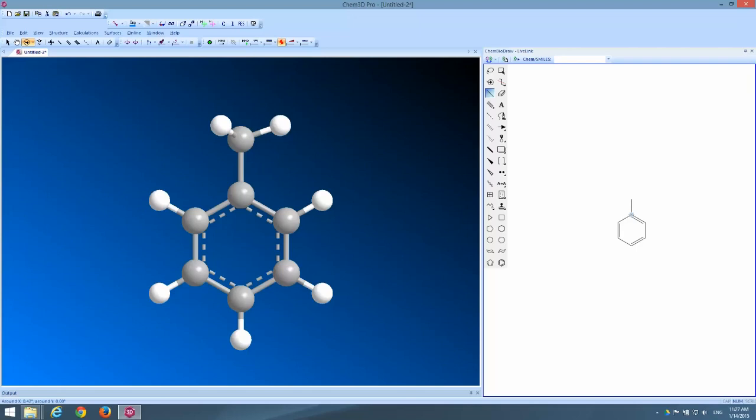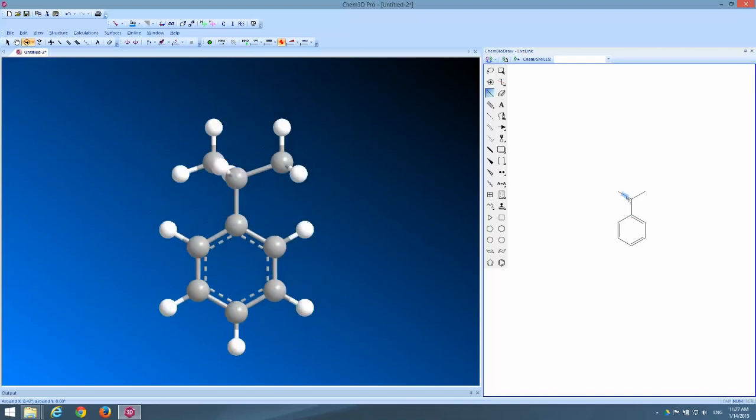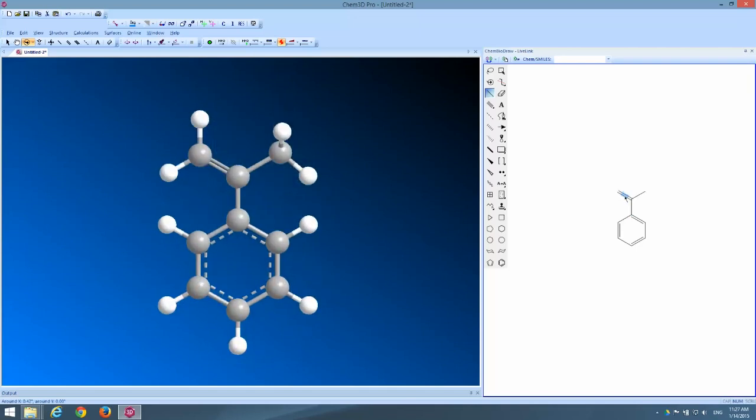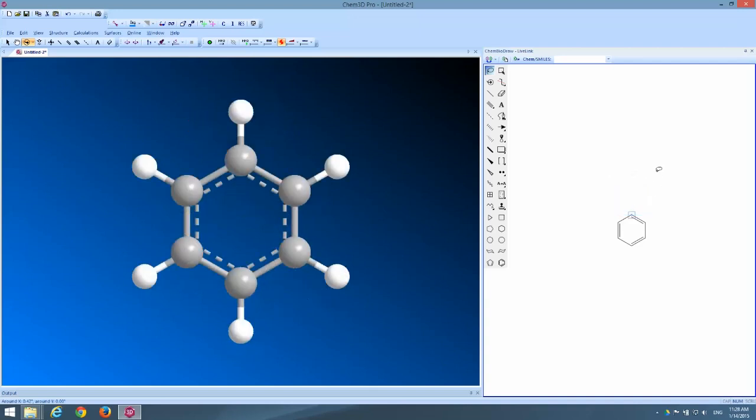Now just as before I have the option of clicking with the mouse to create the bond structure then coming up here to the text tool and using that to insert the atoms to create a carboxylic acid functional group. But just as before I didn't have to do that because ChemDraw can do some of that work for me.